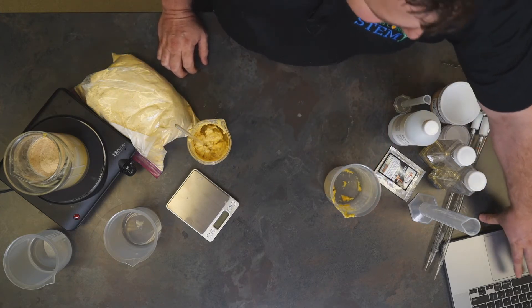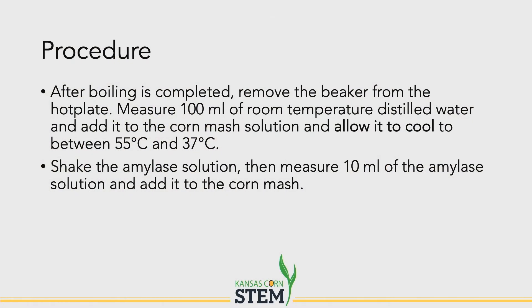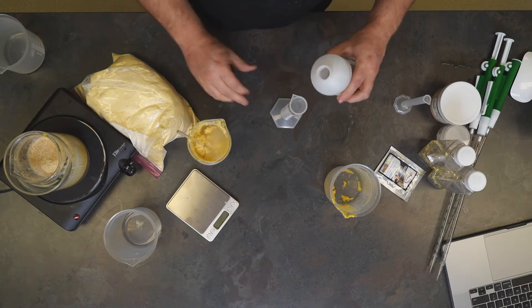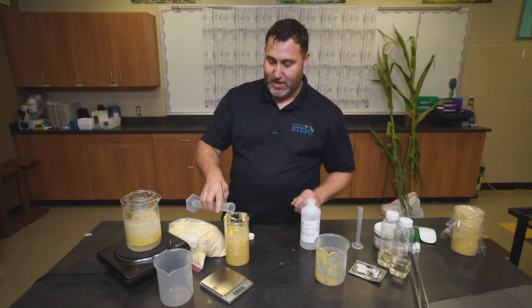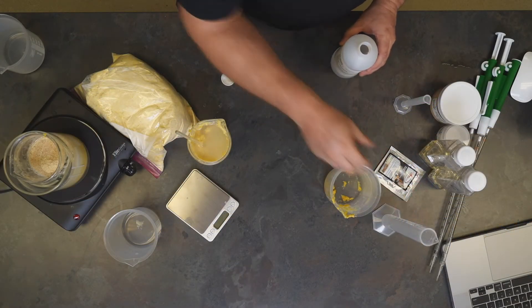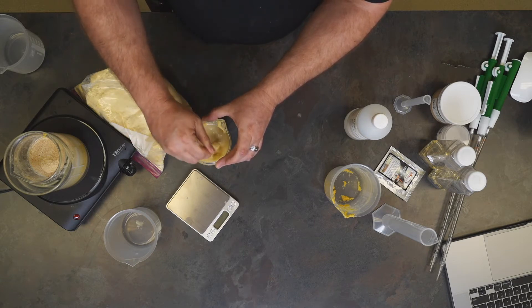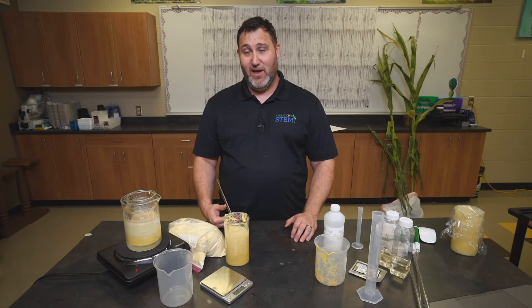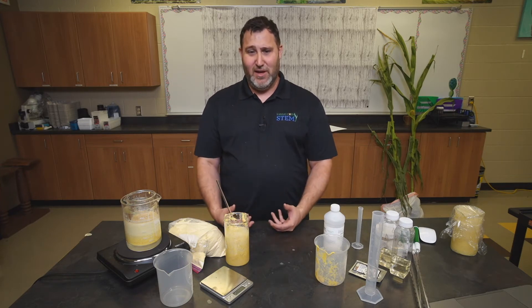Our next procedure after we're done boiling is to add some more water to thin it down and add some buffer solution. We're going to add an additional 100 milliliters of water and 35 milliliters of buffer solution. At this point your corn mash is going to be very hot after it's come off the hot plate. One of the most important steps is to let this cool — you want to get your corn mash down to less than 58 degrees Celsius, somewhere between 58 and 37 degrees, before you add any more of our other products.